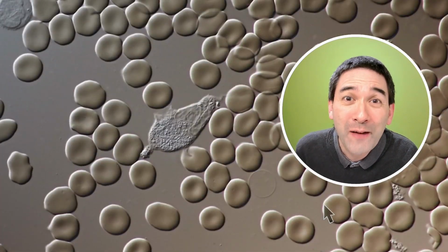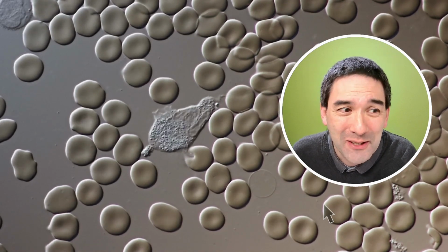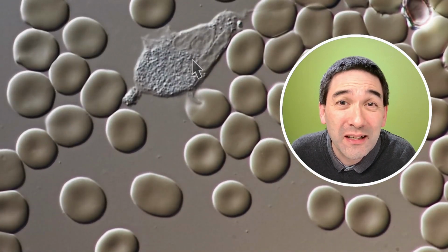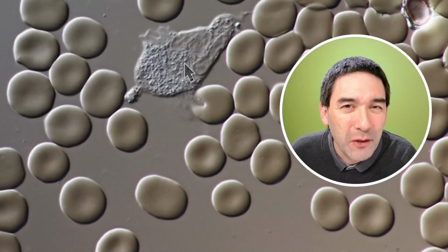Microbehunter here. How fast are white blood cells? This is the question that I would like to address today. What you see here on my left side is indeed a white blood cell. You're able to see it in its original speed, and you see it's not moving very quickly.